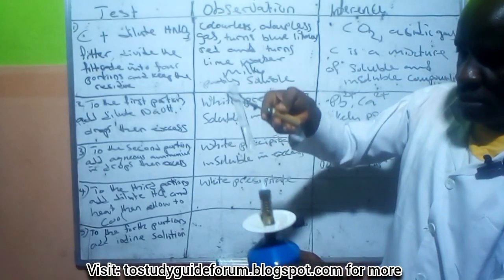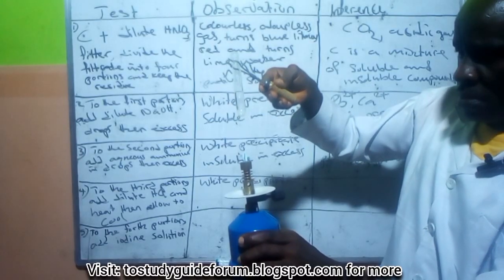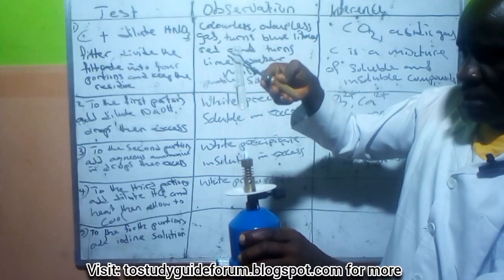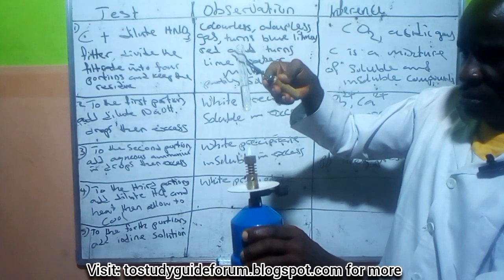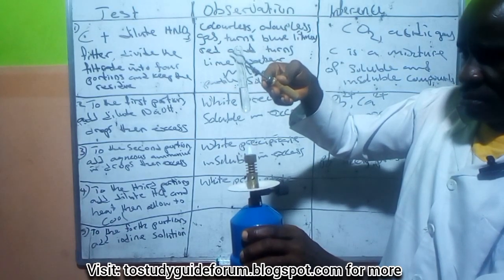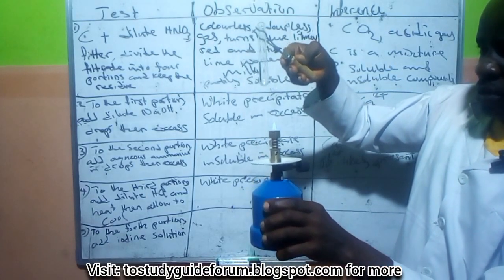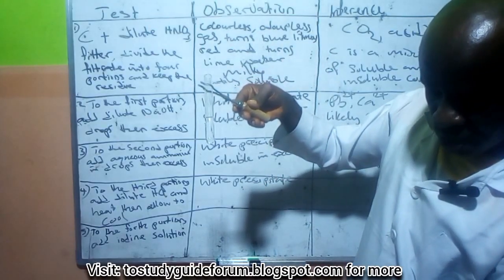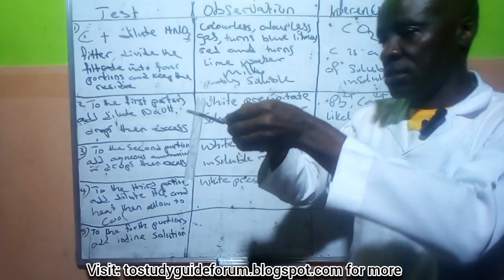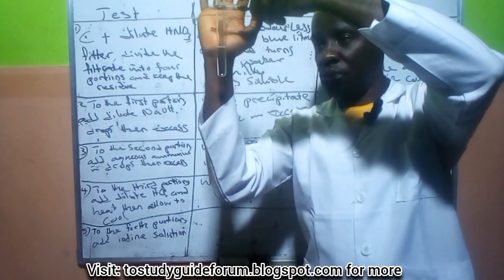So this thing is coming out. You're seeing it. Let's see. I believe you can see what's going on there. It's dissolving. It dissolves. Now, this one can now go off. You can see that the whole thing has dissolved. I want to use my body as a background to show you very well.